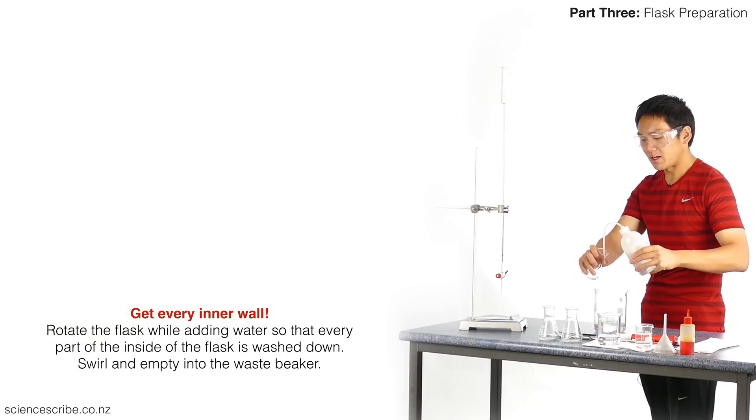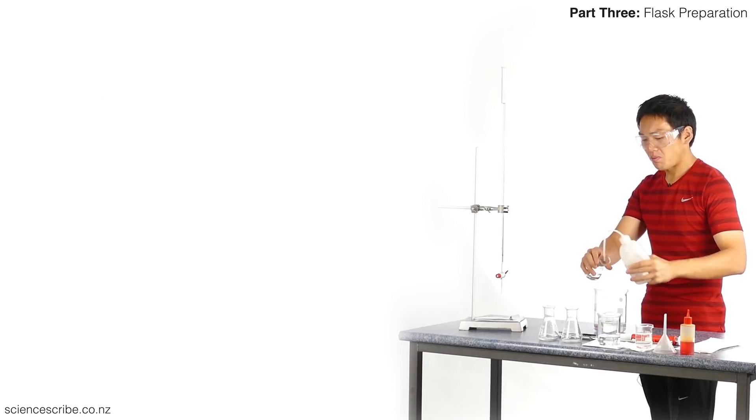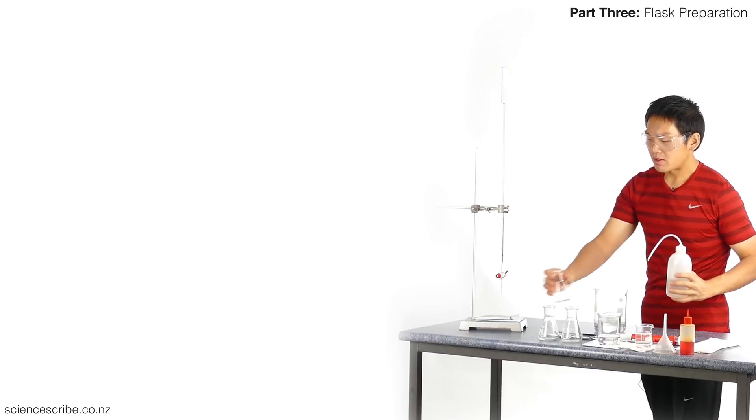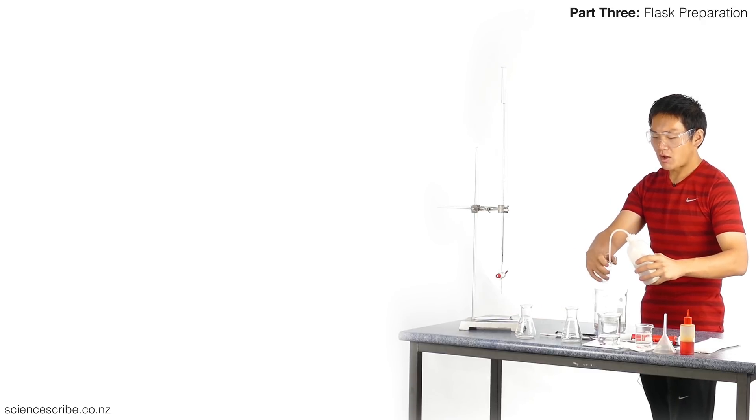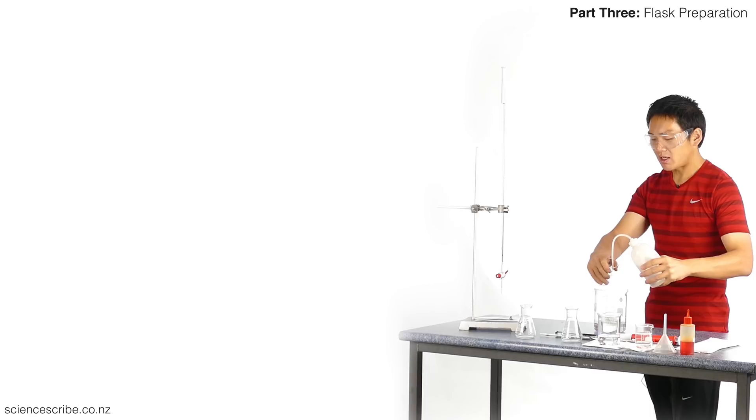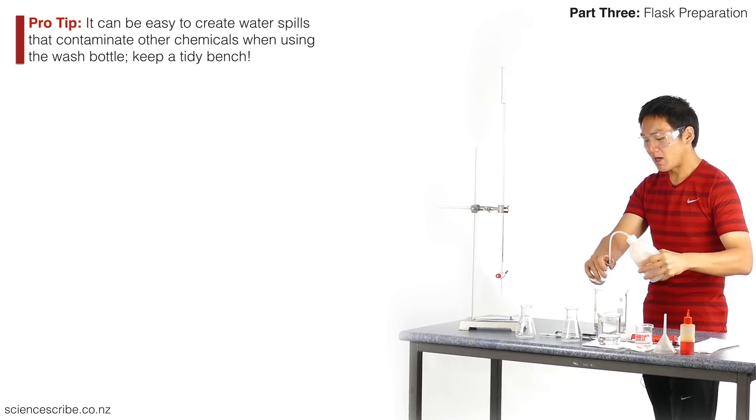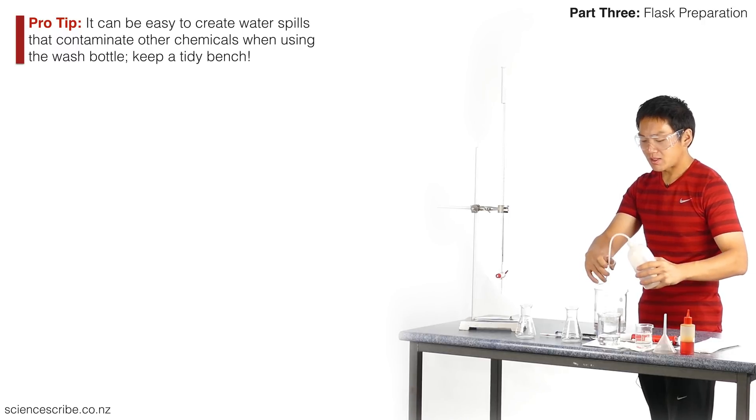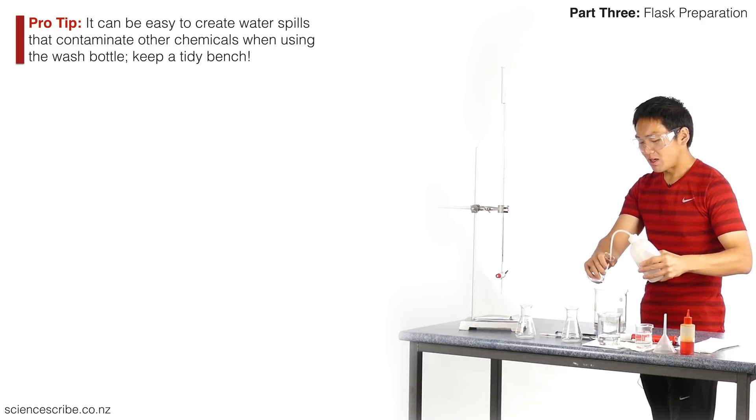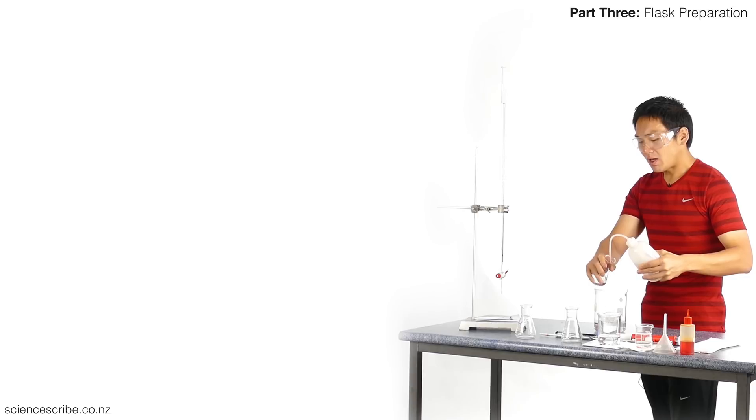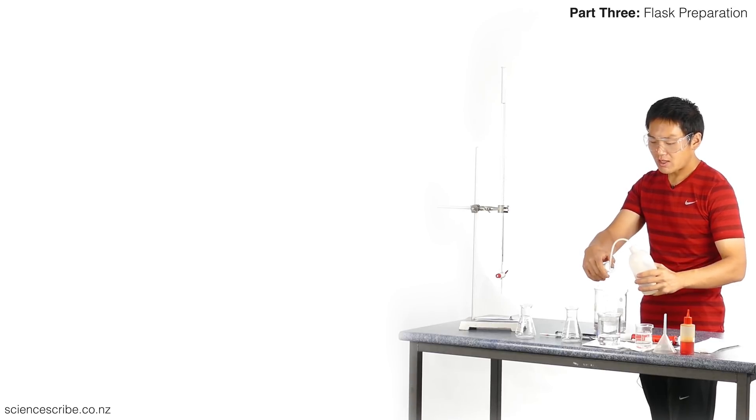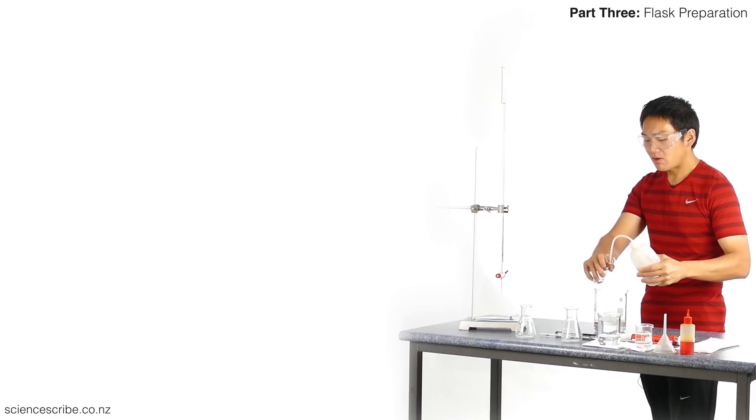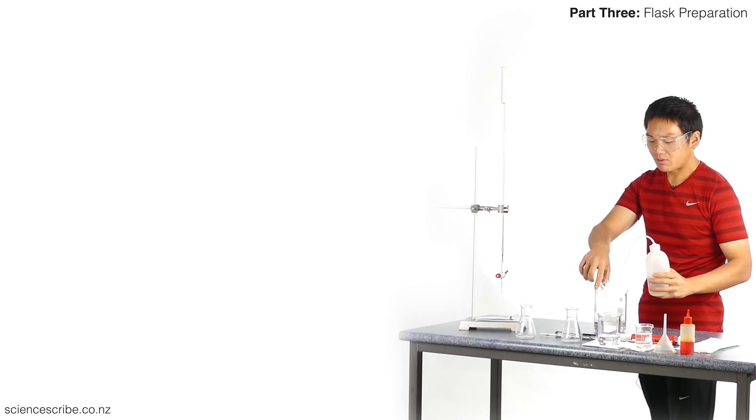You'll also notice that as I'm washing my flasks, my whole bench is actually quite tidy and my chemicals and other equipment are out of the way. That's quite important because the last thing I want is any spill which I'm going to have to waste time cleaning up. If I get a spill on any other equipment, then I have to go ahead and start cleaning that up as well.